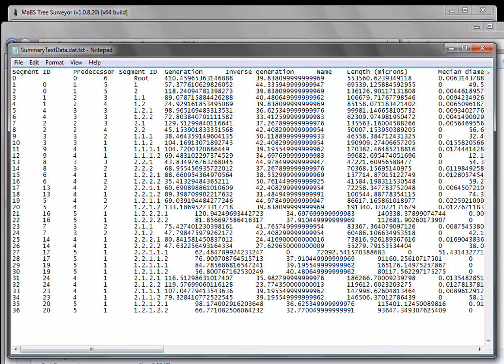So, for example, in the kidney we just looked at, there's some lateral branches where the tips are actually occurring after only 3 or so generations, but the terminal ones, the tips are actually from the root about 5 generations out. So, using this, we can actually look at all the tips or the branches or the segments just before the tips across the whole tree, which is quite handy.